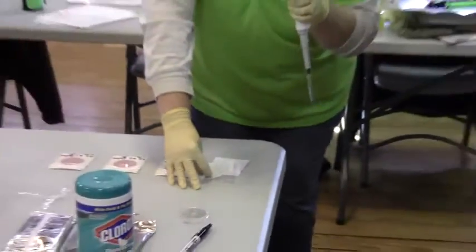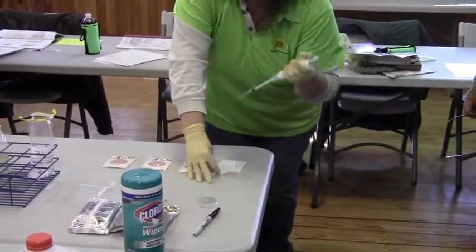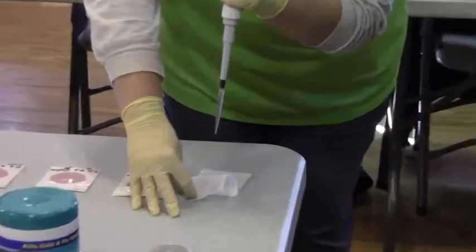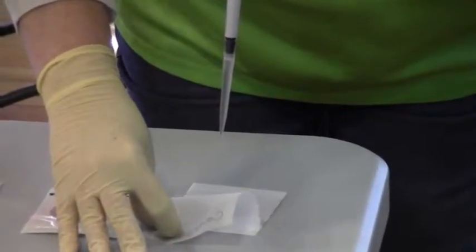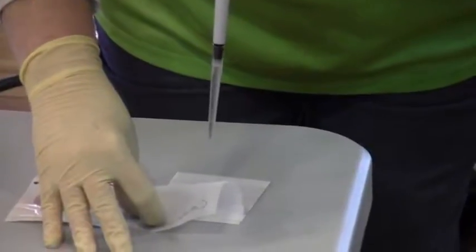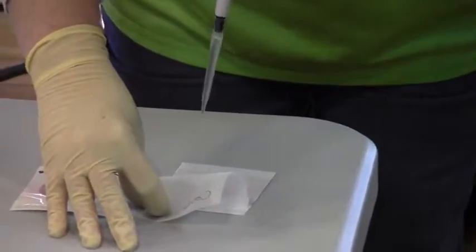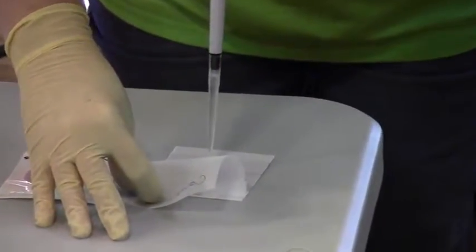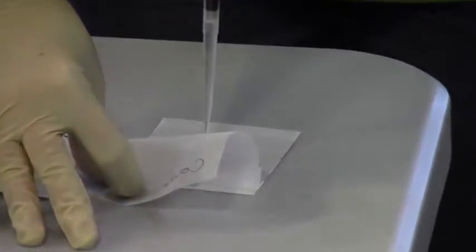There will be scatters everywhere and you'll have to start again. So you want to do it really, really slowly and let the water just soak up into the medium. When we close it, it's going to come off the edges a little bit, but that's okay. Very, very slowly — just let it naturally run out.